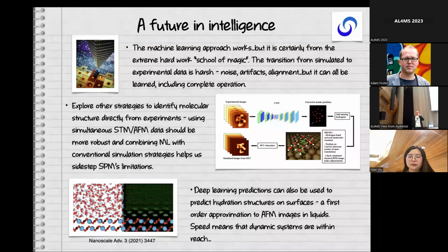I have one actually about the artifacts. You've helpfully shown that machine learning has really helped now to get very high grade images, very comparable to experiments, great for identification. We've overcome so many obstacles. But one obvious thing that has always plagued SPM is that they encode so many artifacts and it's harder to extract the real information underneath. So we've been going down the route of just guessing the model and then reproducing all those artifacts to make it comparable. But can we actually remove the artifacts from the experimental images, and how? What are the methods that are now being considered for this?